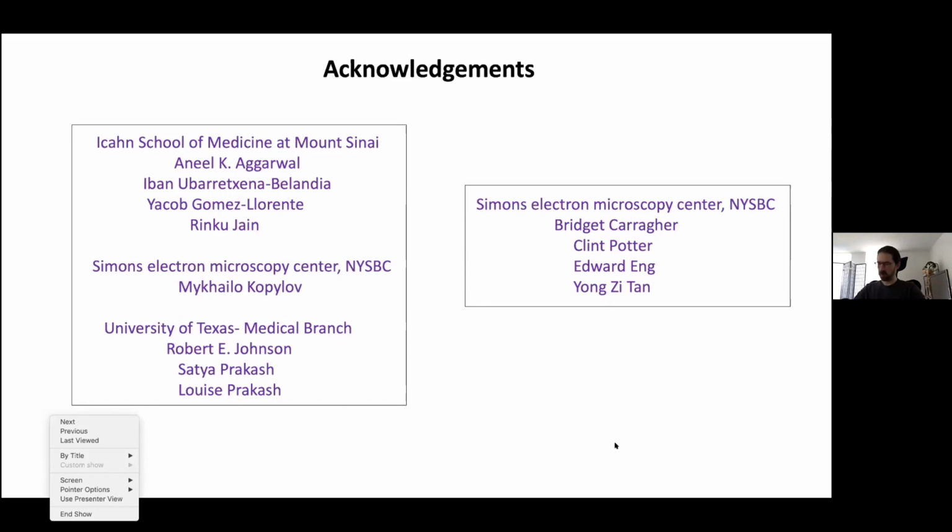Thank you. We have a couple questions related to the grid preparation and the anisotropy. If you had anisotropic problems with the preferred orientation, do you think that's something you could rationalize based on the overall shape of the molecule?